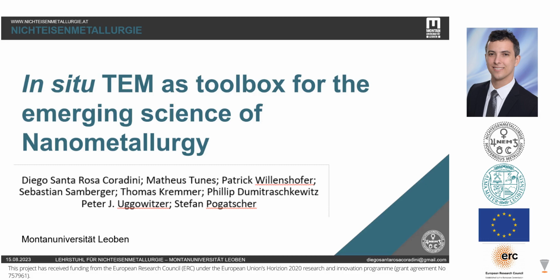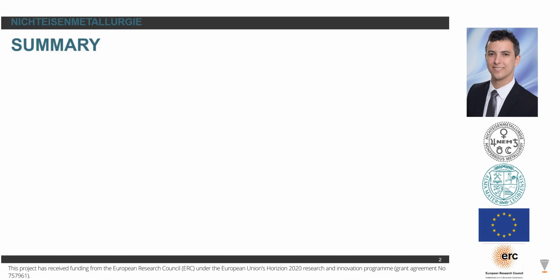This work was published this year, and as the name suggests, in situ TEM as a toolbox for the emerging science of nanometallurgy. We are talking about a new methodology for TEM in situ experiments using different alloying systems. To properly elucidate the topic, I'll be talking about the motivation of the work, along with the description of the methodology, results, and conclusion.